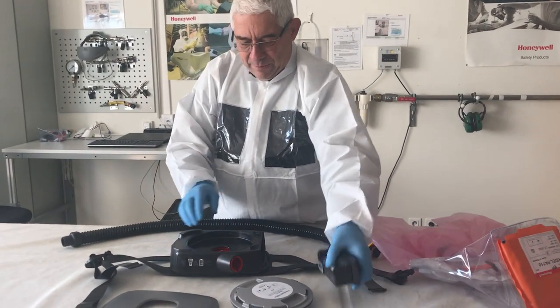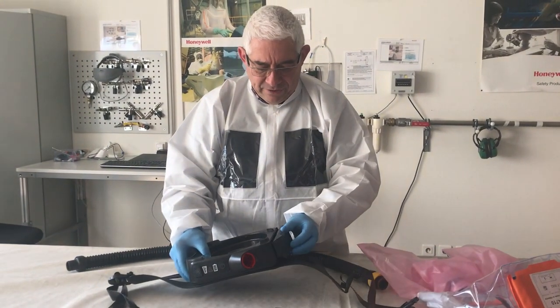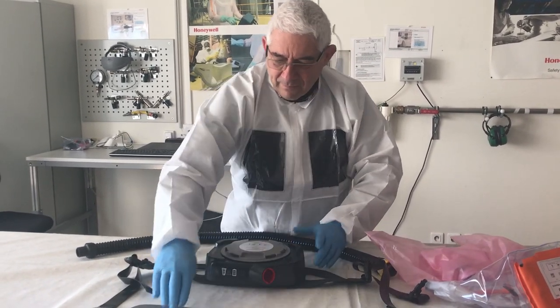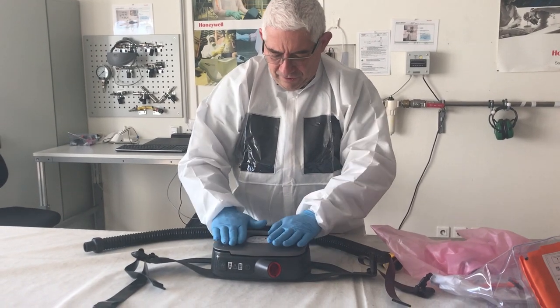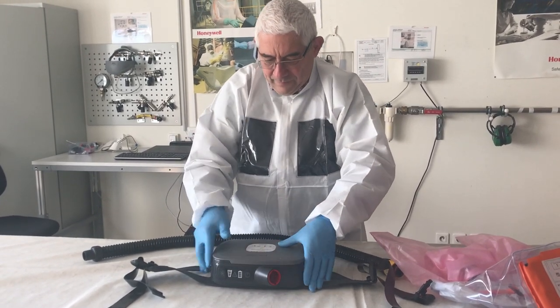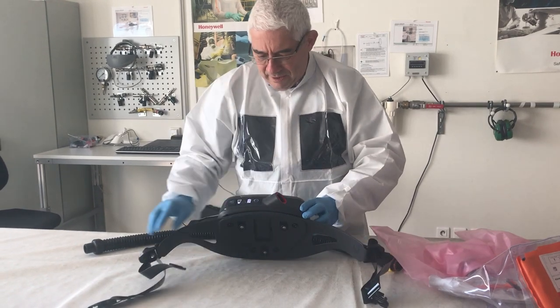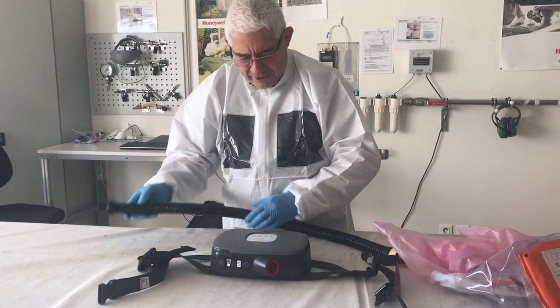To equip the PA700, you set the battery, put the filter on, set the filter cover, and push the button to start the blower. It is working well.